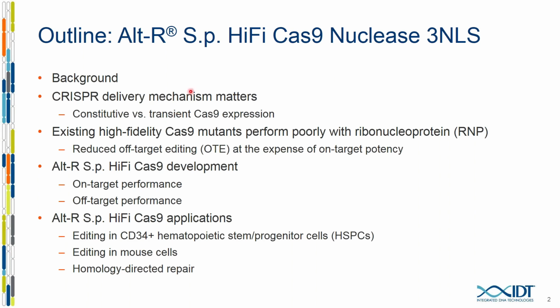Just to give you an outline of what I'll be speaking about today, I'm going to go through some of the basic background on CRISPR, talk about the products that IDT sells and how it works, and then move on to what I think is going to be the main topic today, and that is the notion of off-target editing. And really, what I'm going to hit on the most is that the delivery mechanism matters.